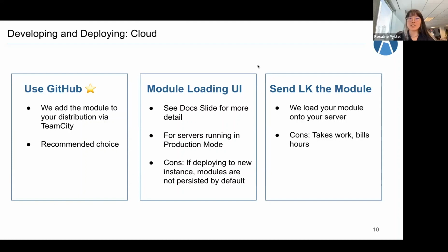Lastly, you have the option to send us the module that you have developed for us to load it onto your server. However, this takes work on the part of our DevOps team, and so does take up billing hours.